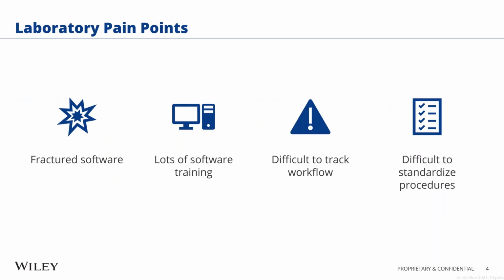So laboratory pain points. A lot of labs have fractured and often out-of-date manufacturer software on their instruments. If that's the case, maybe each instrument has a different software package with a different way of processing and quantifying data, if it has it at all. And it creates this situation where people need to be trained on a smorgasbord of different softwares. It's a huge time commitment to get trained and become proficient in all of the software that the lab uses.